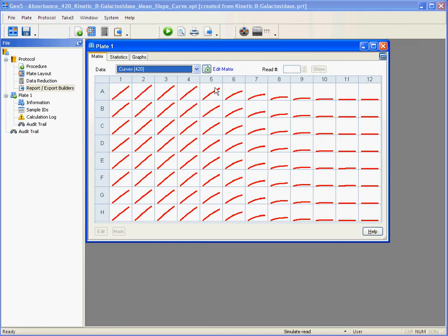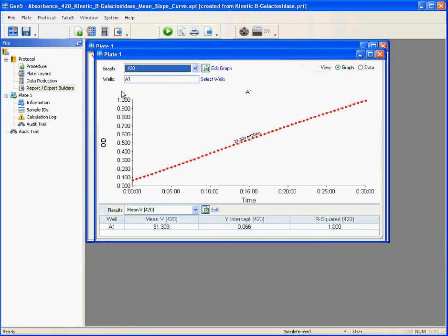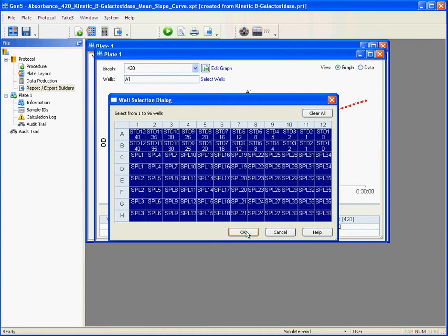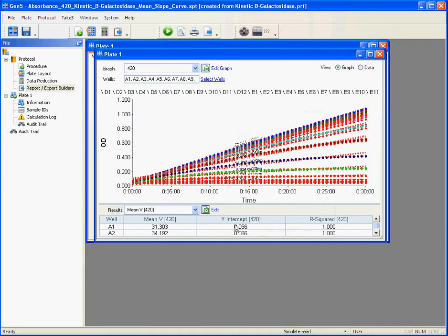In the case of this kinetic assay here, if you zoom on one of the kinetic curves, you can basically select the entire plate and have all of the curves overlapped if you want to.